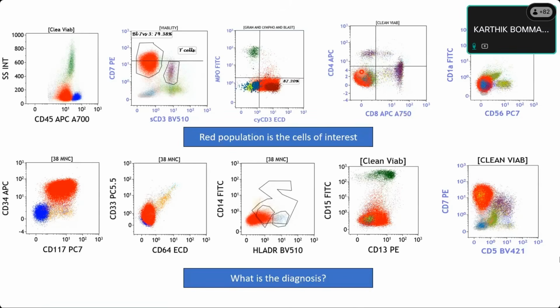Okay, what is CD4 and CD8 expression? This is my normal internal control for CD4. The blasts are negative. And CD8 expression is also negative.